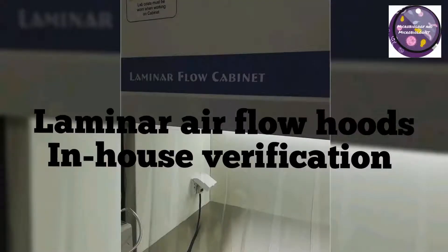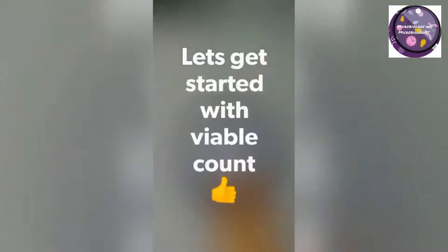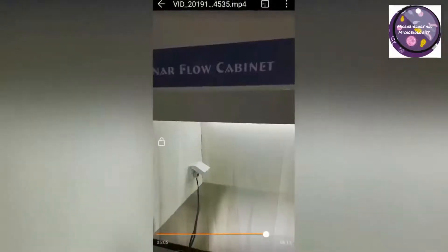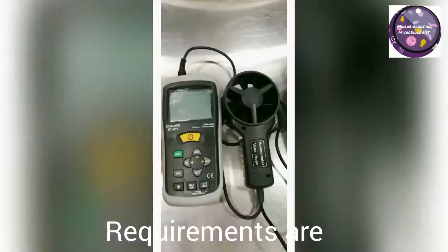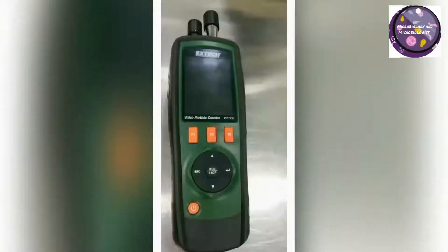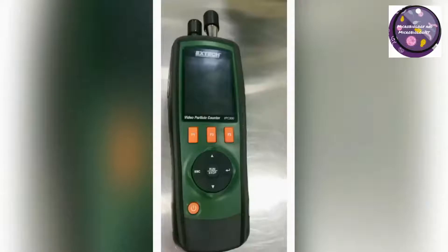I will show you about the laminar airflow hood verification as per my SOPs. Let's get started. The requirements for verification of laminar airflow hoods are an anemometer or air velocity meter, a particle counter, and pre-incubated media plates.